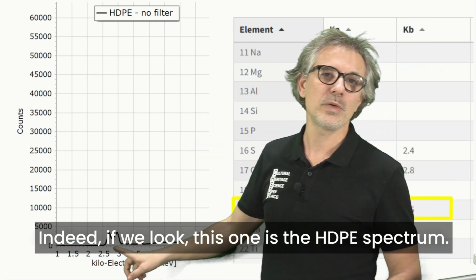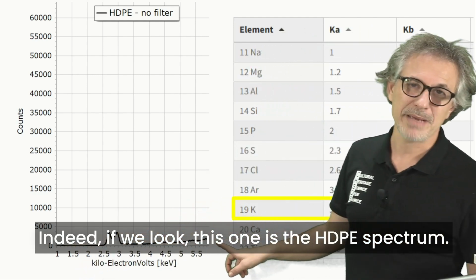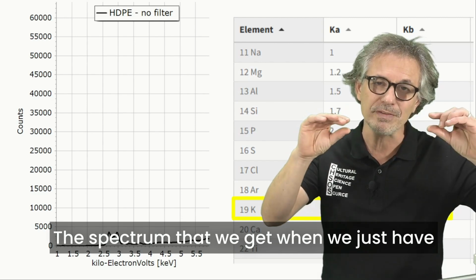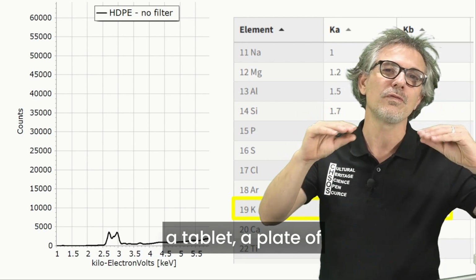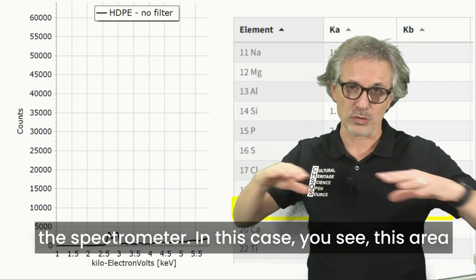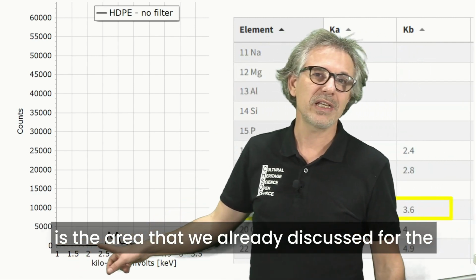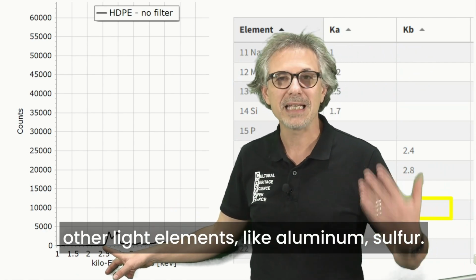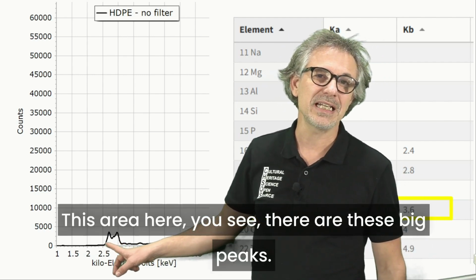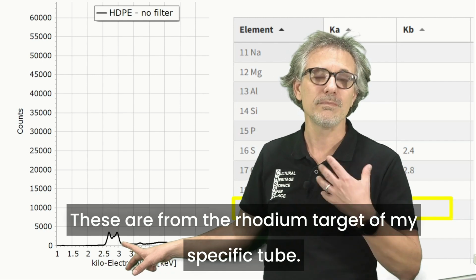Indeed, if we look, this one is the HDPE spectrum, the spectrum that we get when we just have a plate of high density polyethylene under the spectrometer. In this case, you see this area is the area that we already discussed for the other light elements like aluminum and sulfur. In this area, you see there are these big peaks. These are from the rhodium target of my specific tube.